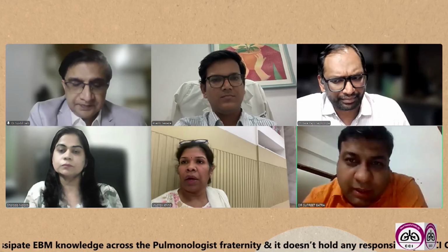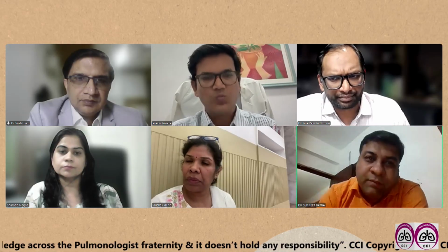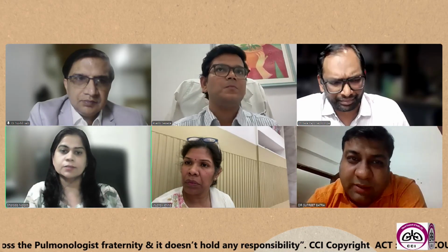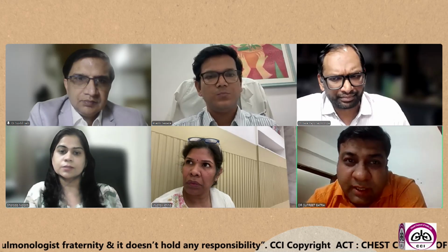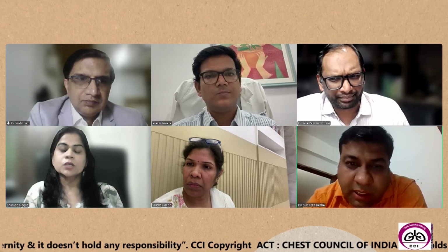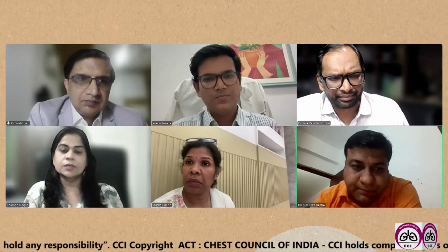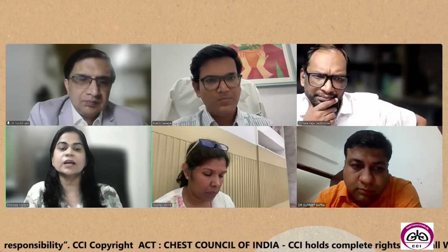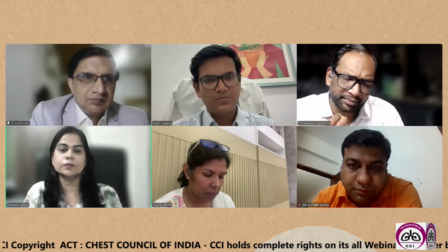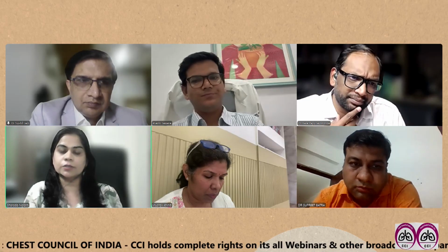Sir, I have one question. Yeah, please. Ma'am, do you recommend that we should prepare a slide before taking the sample? Yes. And the other thing is, what about the medium, sometimes the liquid, the LBC? Liquid-based cytology, yes. This is used in some centers where they have an LBC machine. It is an automated machine, and they have their own fixative, like CytoLyt used for ThinPrep and SurePath solution used for SurePath.